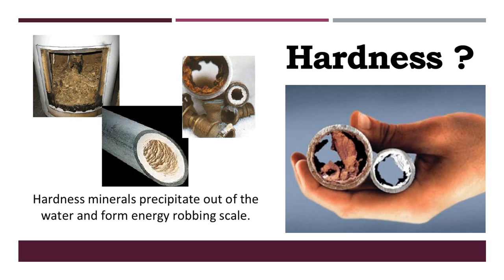And the reason, look at here. Look at these pictures. These pictures are the insides of piping that hard water has traveled through over the number of years. And look at the way it looks on the inside. You begin to see this precipitation that begins to happen on the inside of the pipes. And we do not want to see that, because we begin to lose water pressure.